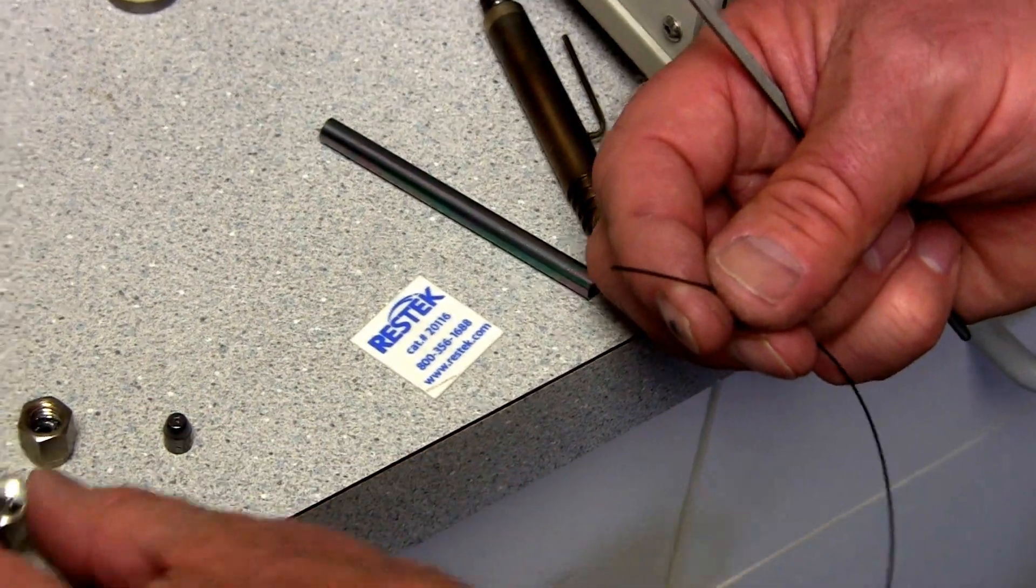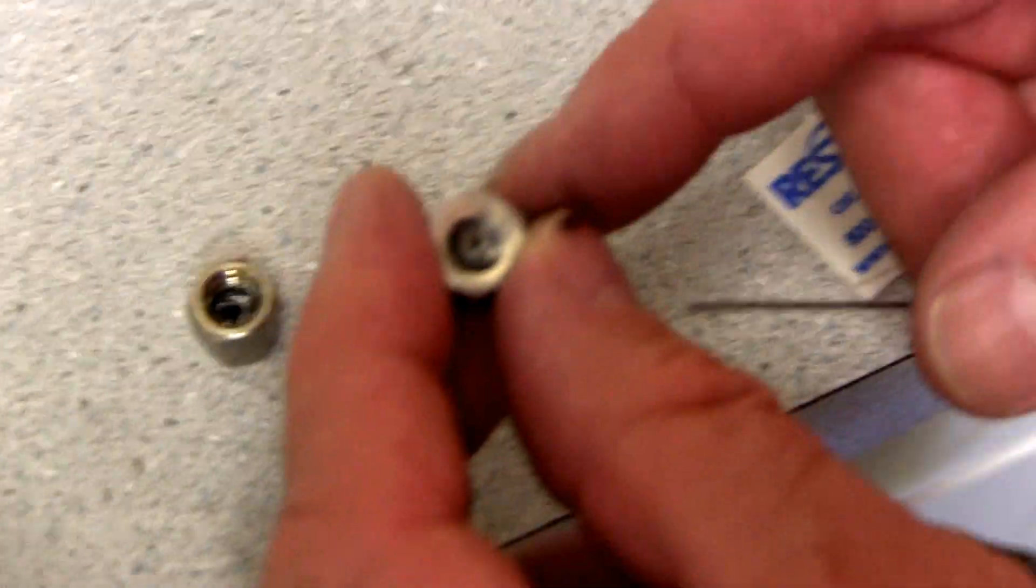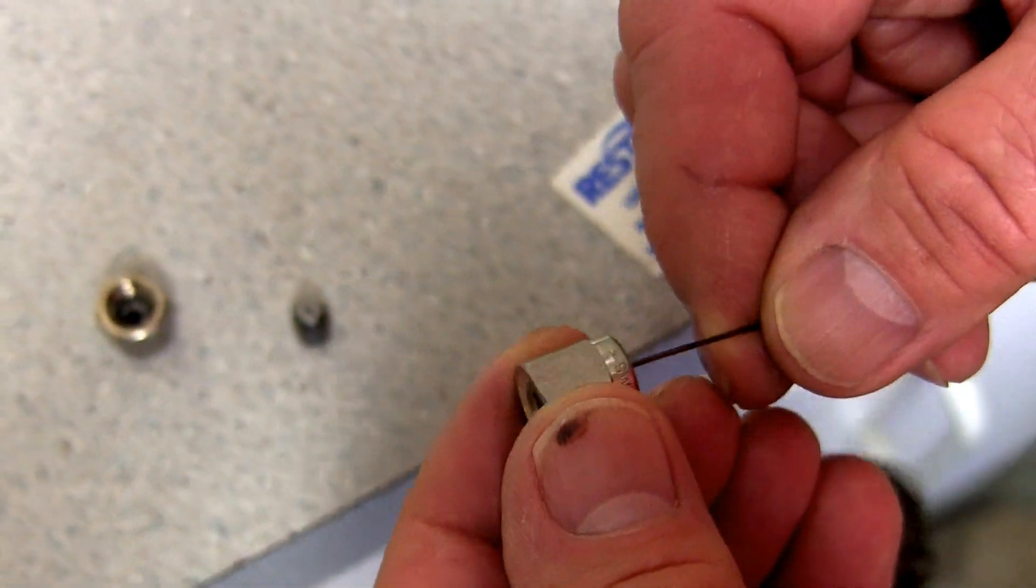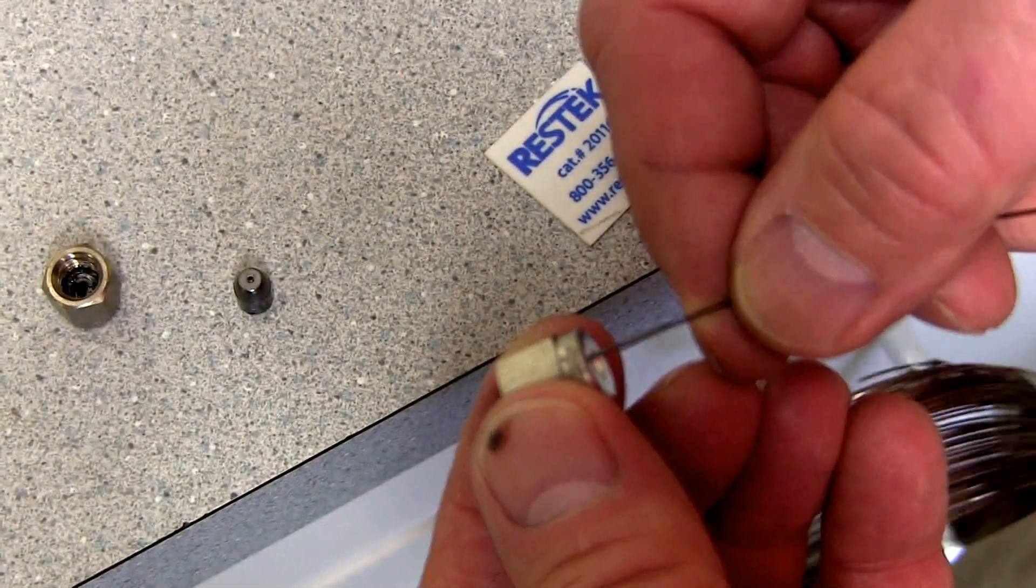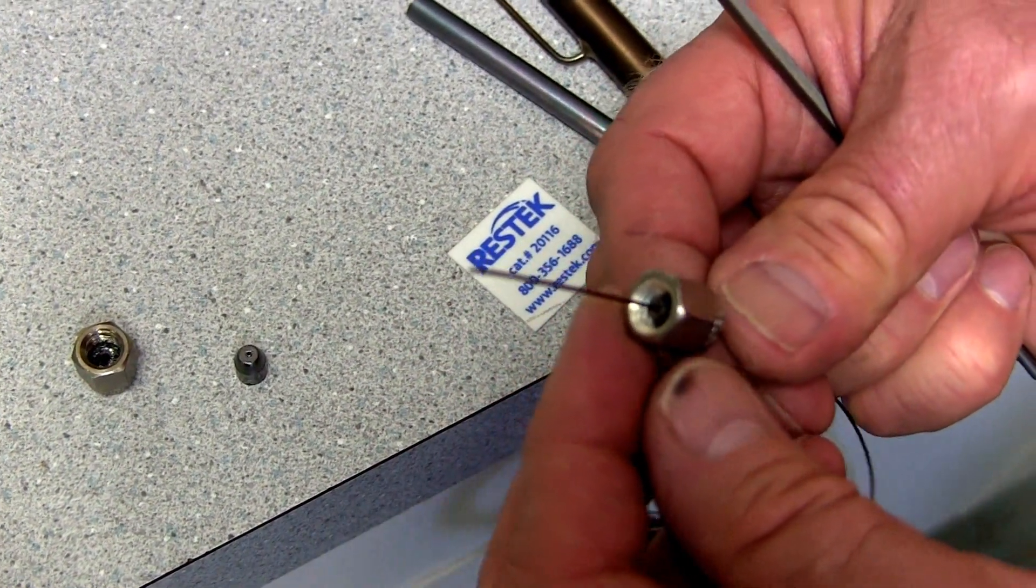This is still usable. When the graphite ferrule inside the nut looks like that, it looks like it's still got the conical shape, then it's still fine to use. Sometimes you can get 10, 20, even more uses out of a ferrule before they get damaged.